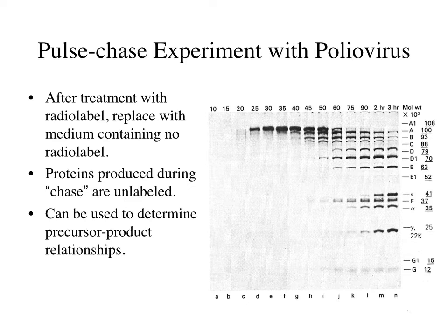And you start off with one large labeled band. Remember, bands up at the top are going to be your largest proteins. Smaller proteins will migrate further down the gel. Now, over time, notice what happens. That large band disappears, and you get the appearance of many small bands.